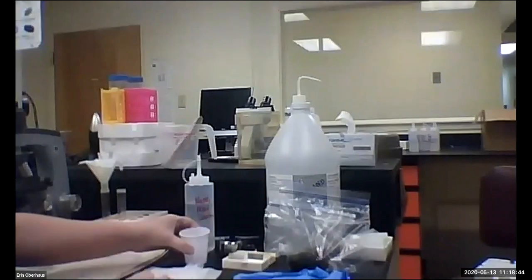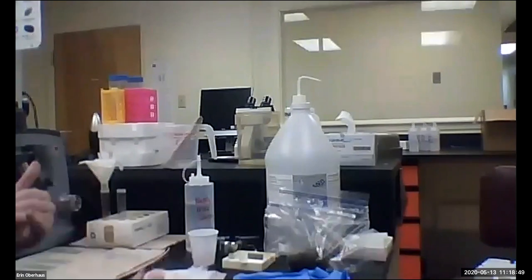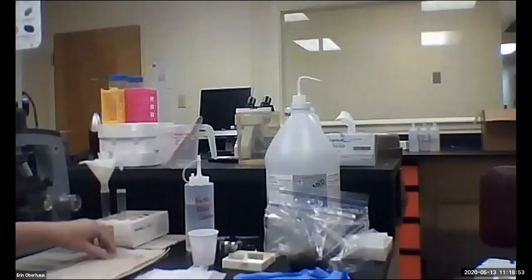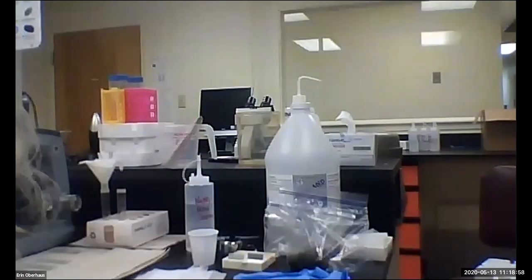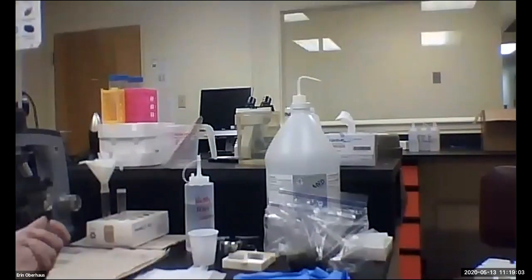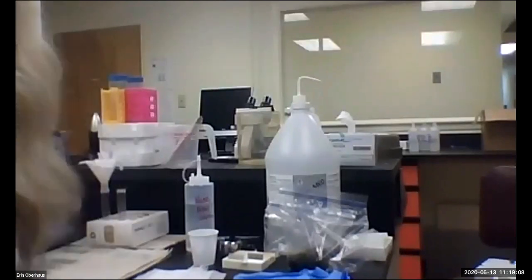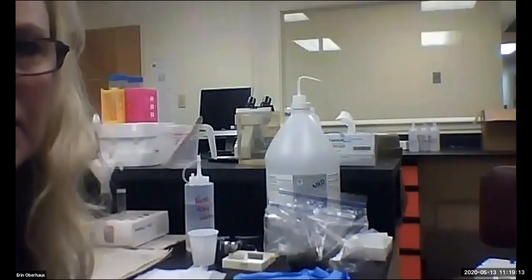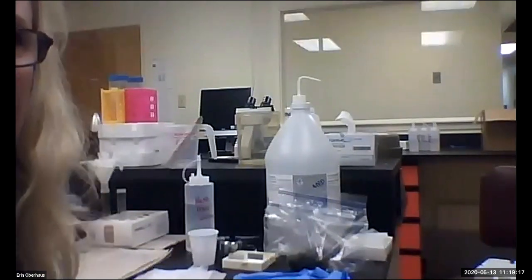You will need some sort of container to mix your sample with. There's a couple of different techniques out there. I think most common anymore is the use of the McMaster slide, which has the benefit of a grid system that allows you to better visualize and count your eggs. I'm a creature of habit and I tend to do things the old-fashioned way like I was taught, so today I'm going to show you my way. There are some other great YouTube videos on using the McMaster technique, where the procedure is pretty much the same, just a couple of different steps.